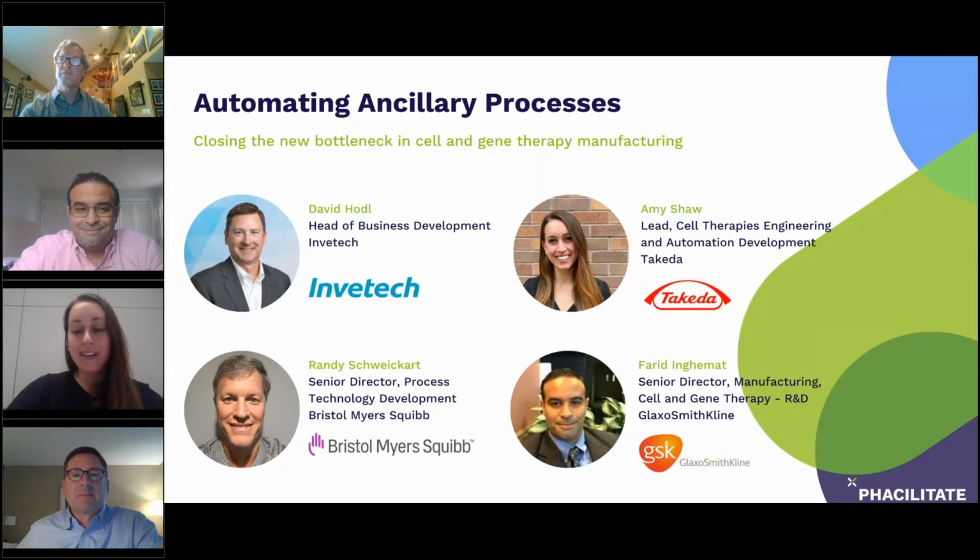So when I look back to the last 5 to 8 years in cell therapies, we've come a long way. Back then we were really leveraging devices that were coming out of clinical settings, things like the Cell Saver 5, which is used to recycle blood in surgery. We were using that as a cell washing tool. Now, when we look across the market, there's a lot more automated devices for that process unit. Granted, there's still a lot of ranges in terms of volumes and other things that we can improve upon. We've still made a lot of advances in this short amount of time.